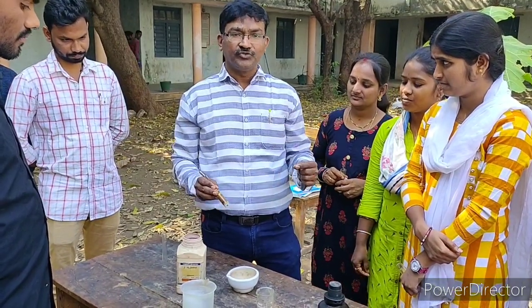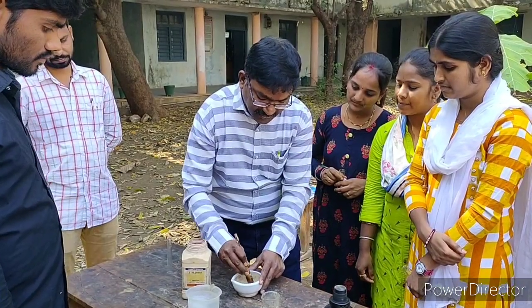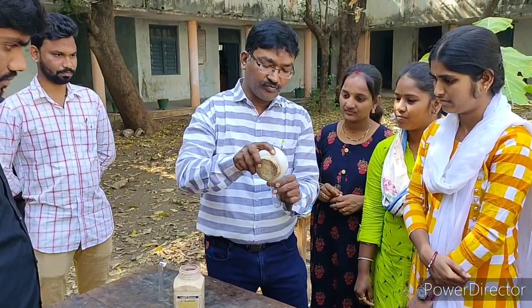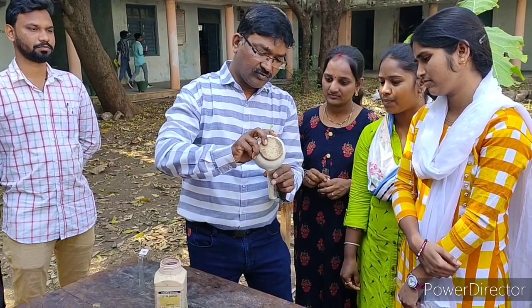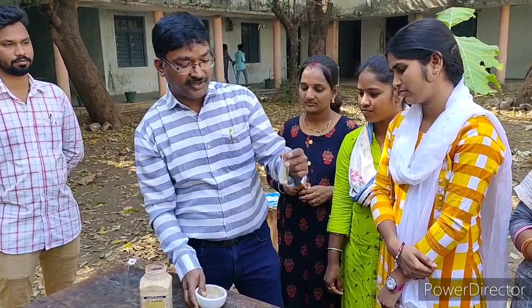So we have to make it into fine powder — fine powder means smooth powder. After powdering it, we have to transfer it into the boiling tube. It is better to take it with the help of a spatula, but here I am taking it directly.